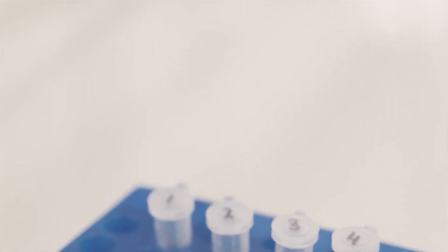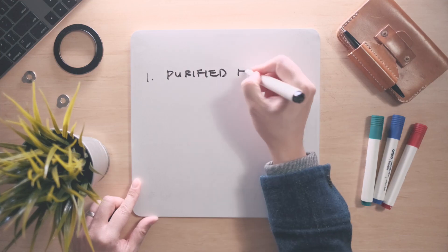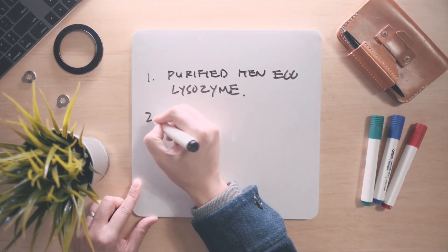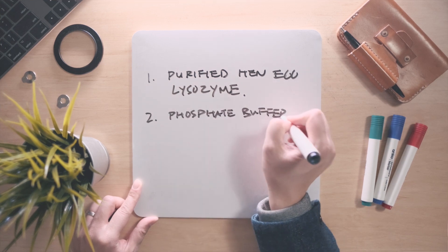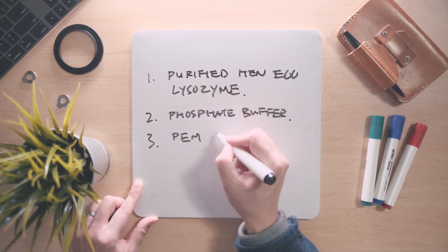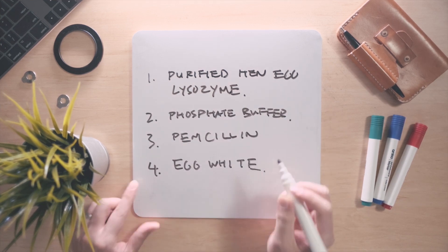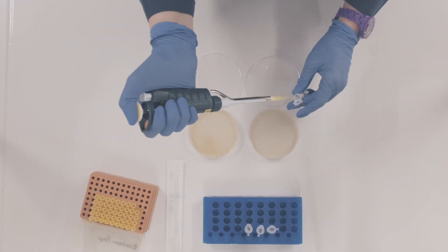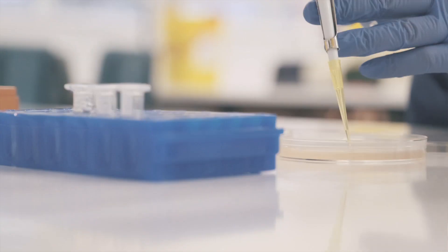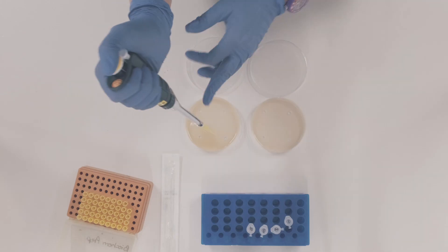We will be testing 4 solutions: Purified Hen Egg Lysozyme, Phosphate Buffer, Penicillin, and Egg White. With a 200 microlitre pipette, add 25 microlitres of test solutions to the wells.